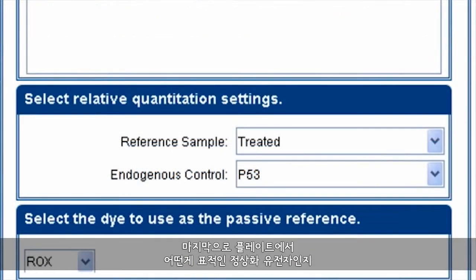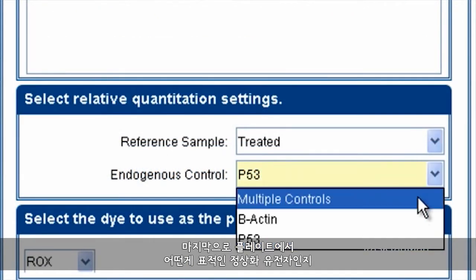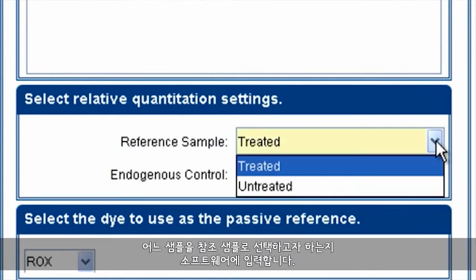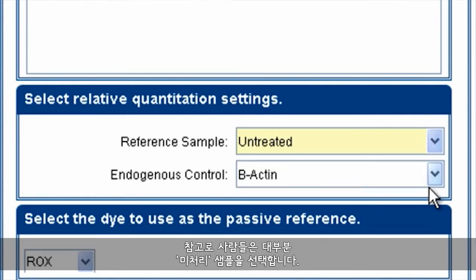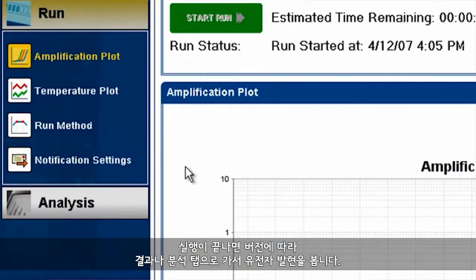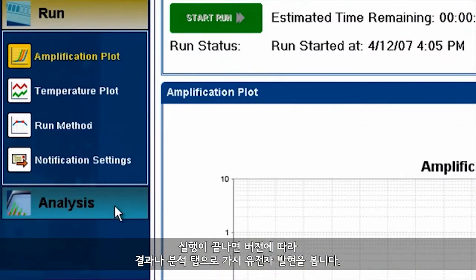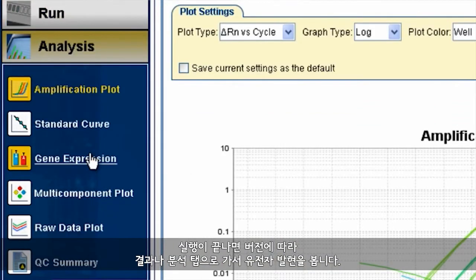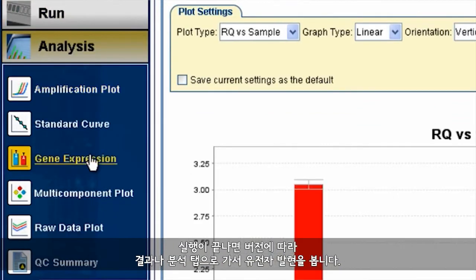Finally, tell the software which target on the plate is your normalizer gene, and which sample you want to choose as the reference sample. Most people choose the untreated sample, by the way. At the end of the run, simply go to either the result or the analysis tab, depending upon your version, and to gene expression.